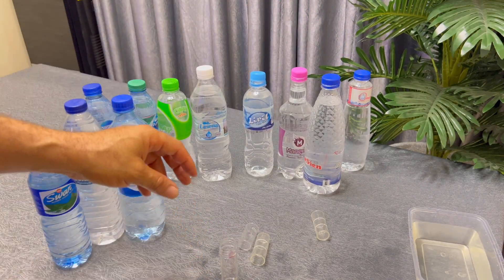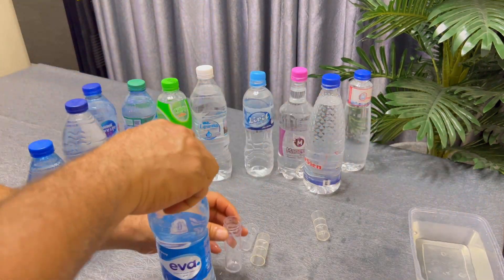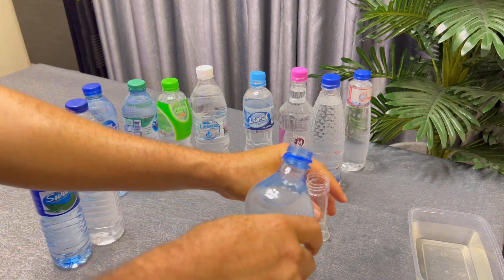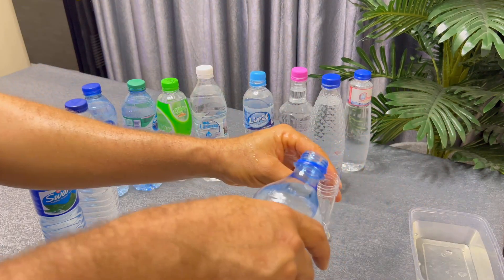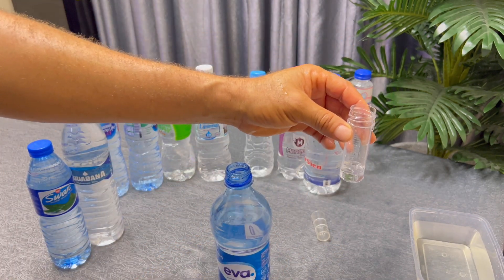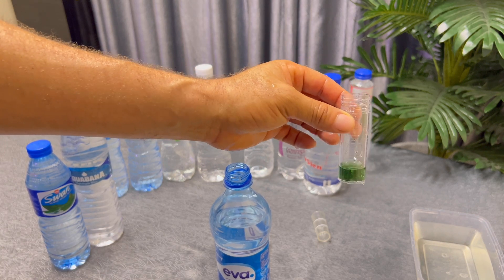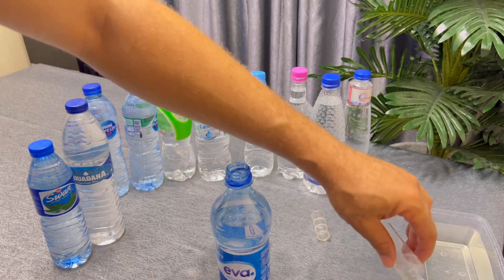Next we have Eva water from the supermarket. I uncork the Eva — you can hear that. I use the Eva to rinse the test tube, then drop five millilitres into the test tube and add two drops of the liquid tester — one, two. It actually passed the test also. Taking it to the chart — pH 7. We'll trash it and take it backstage.